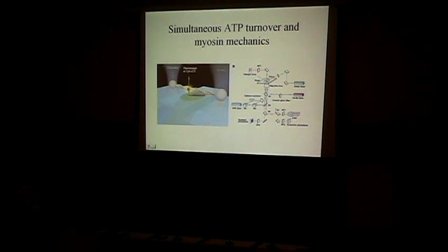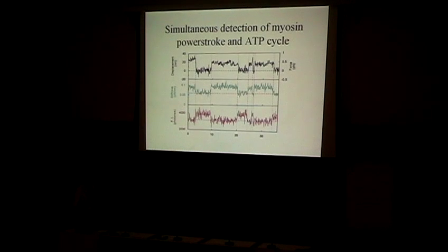That had been done previously by many different groups, but the innovation there is that they could also measure the binding of ATP, with a fluorescent label called Cy3. And here they do a TIR experiment by having a microfabricated pedestal of the glass, so that you can still have the beads on both sides, but your molecule can be very close to the surface of the glass. And this is the data from the paper.